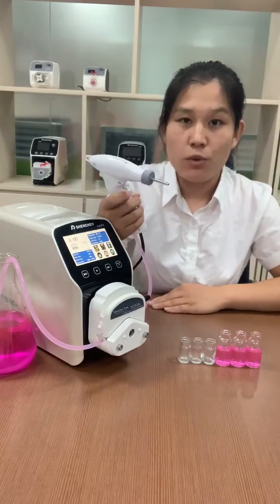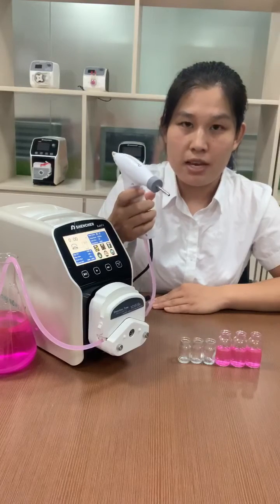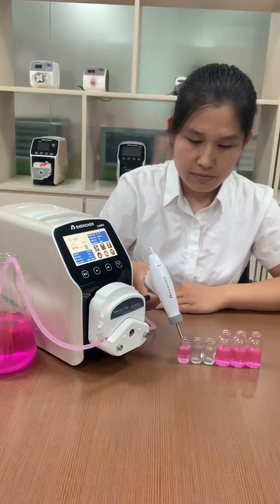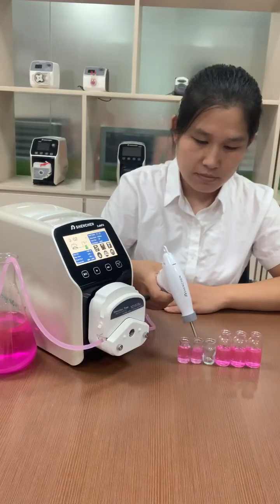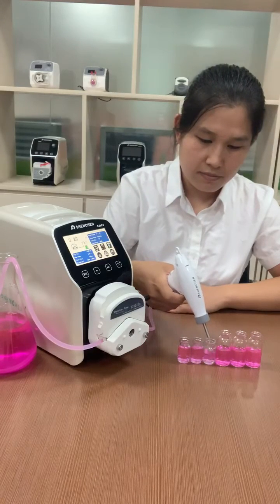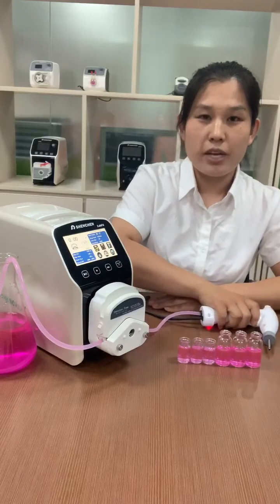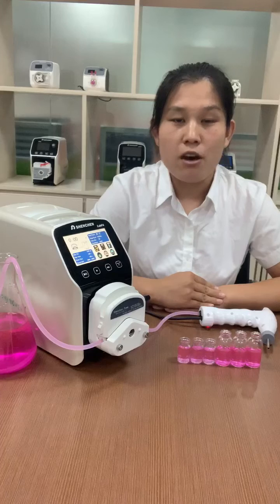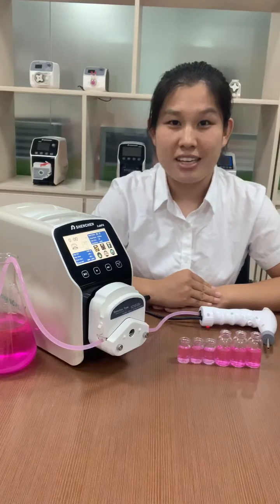For the start button, you only need to press one time. Now we can see the filling result is very good. The filling accuracy can be 0.5 percent. Thank you.